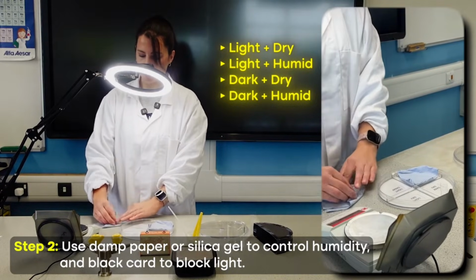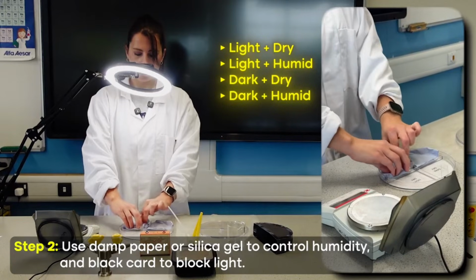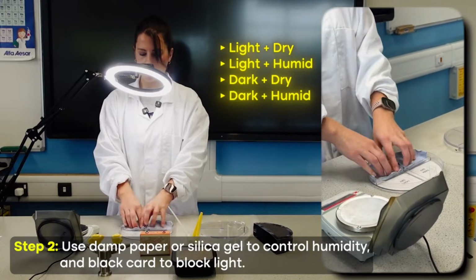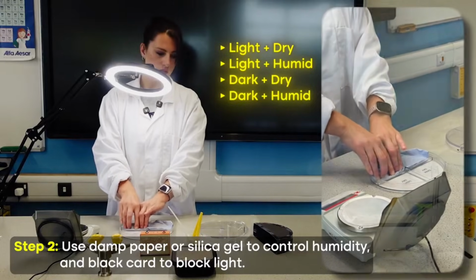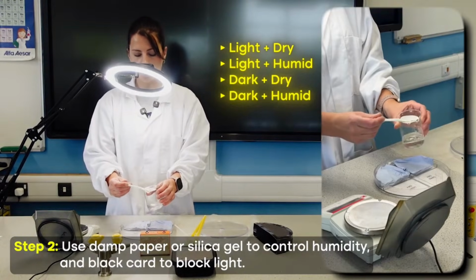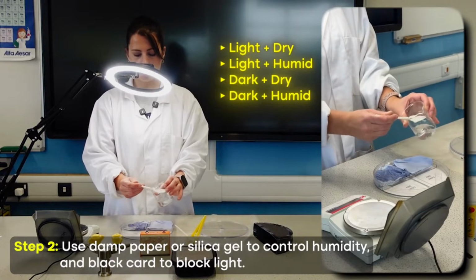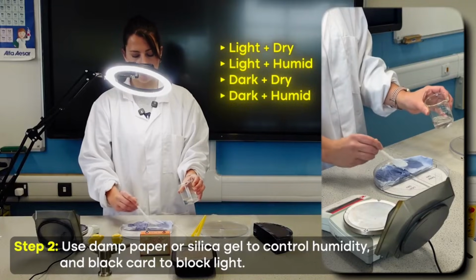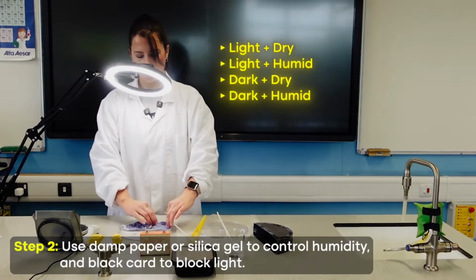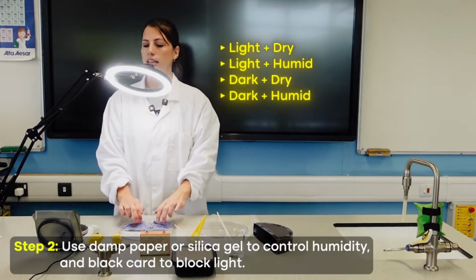I'm going to get my next piece of paper towel in on this side, and then we need to add the same amount of water to that same size piece of tissue, just so we're keeping that controlled. Now you could be far more accurate with this. I'm just going to say I'm going to do 1 level teaspoon onto each. If you wanted to, the students could use a syringe or a pipette to make sure it is a more accurate measurement of that. I'm just going to make sure that is fully damp all over. So we've now got our 2 damp sections.